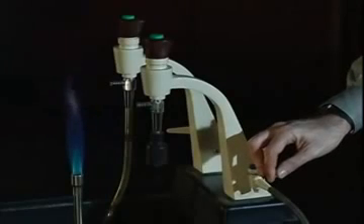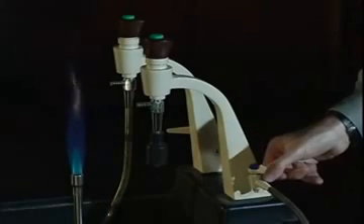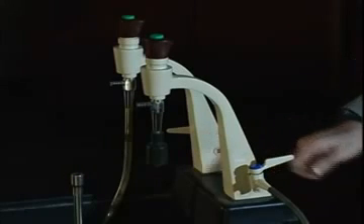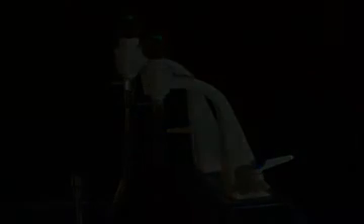When turning off the Bunsen burner, extinguish the flame by turning off the gas outlet at the laboratory bench. The gas is off when the lever is perpendicular to the nozzle.